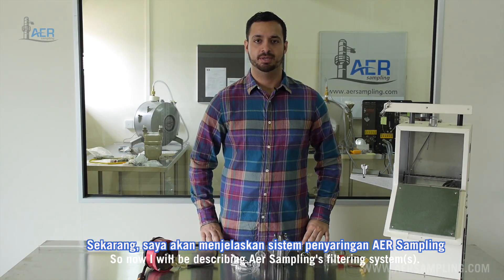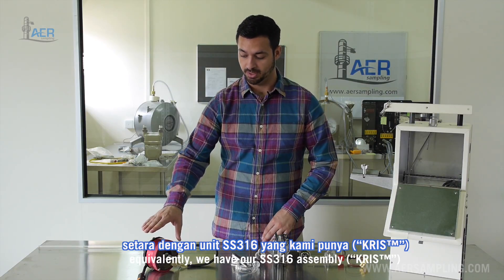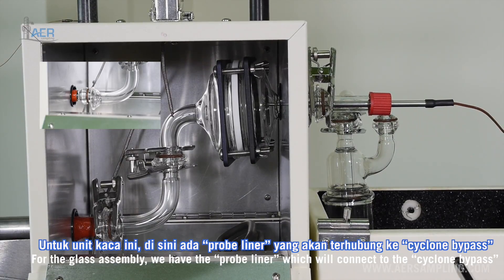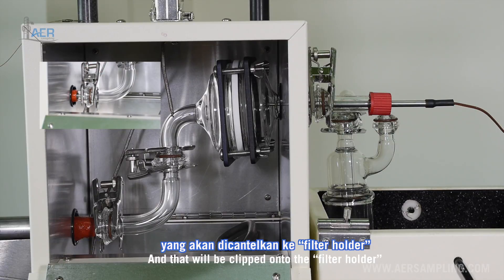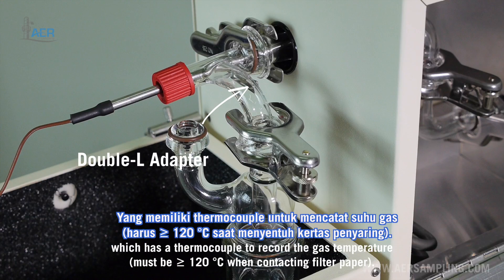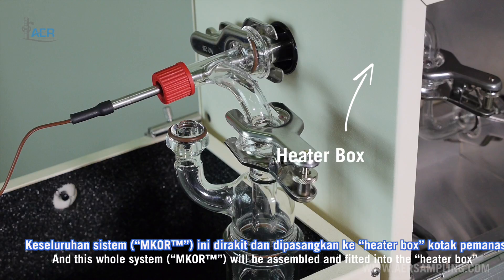Now I will be describing AER Sampling's filtering system. Here's our glass assembly, and equivalently we have a stainless steel 316 assembly. For the glass assembly, the probe liner connects to the cyclone bypass, which is clipped onto the filter holder, and then clipped to the double-L adapter which has a thermocouple to record the gas temperature. This whole system is assembled and fitted into the heater box.